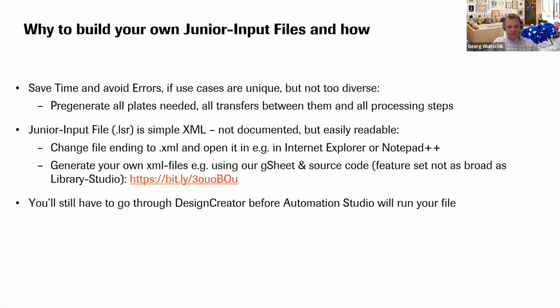I want to have everything enclosed in one big shell so that I don't have the problem of inconsistent data. I want something that is super easy to use, even for a casual user. This could be visiting people wanting to run their own stuff, technicians, or interns, whom you want to get productive very quickly. Lots of motivations.